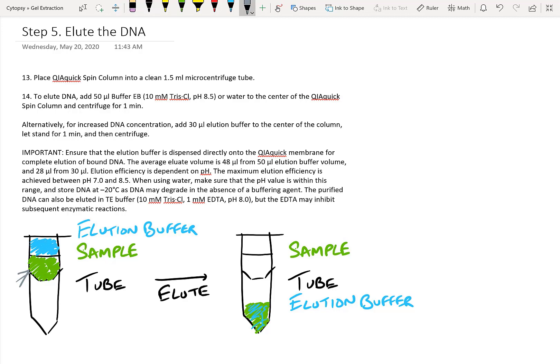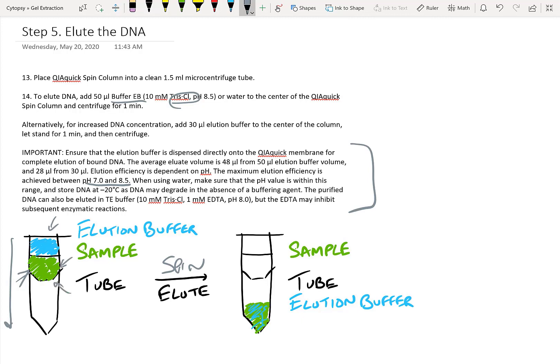It's finally time to collect our sample. In order to do that, we use EB buffer, which contains Tris-chloride at a certain pH. This elution buffer only works when it's between pH 7 and 8.5 — that's the maximal elution efficiency. So when you use this protocol, make sure that even the water you add to dilute the EB buffer has the right pH, as noted in the important note. We add elution buffer on top, then spin again. As it flows through the column, it disrupts the interactions between the column and the sample. In the end, you should have elution buffer with your sample collected at the bottom of the centrifuge tube, ready for the next step.